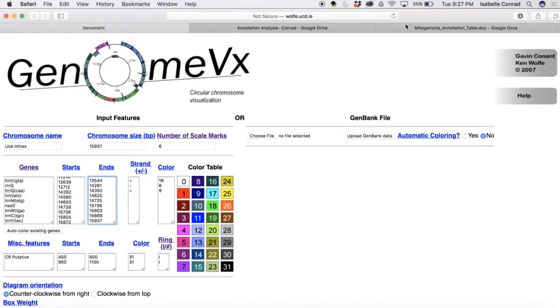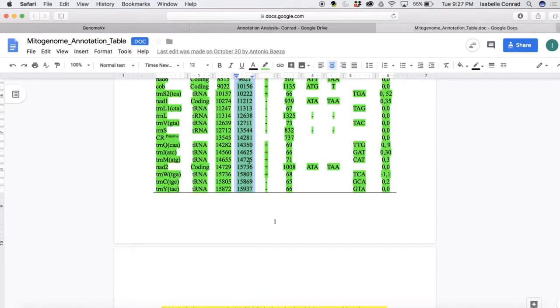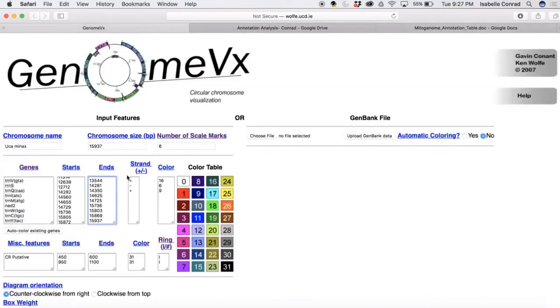And we are going to go find the control region end nucleotide number. So we found that. We're going to delete that 14,281.